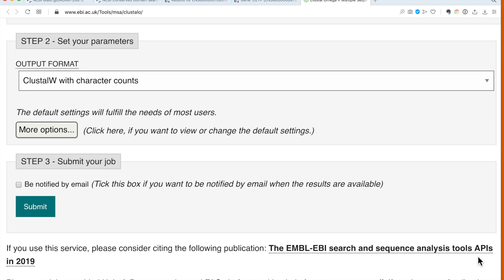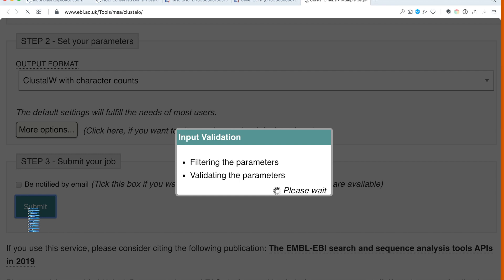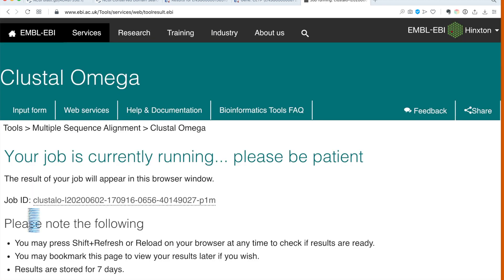We go with the default settings. Just clicking on go will get our job running, and we need to wait a couple of moments before we can see the results.